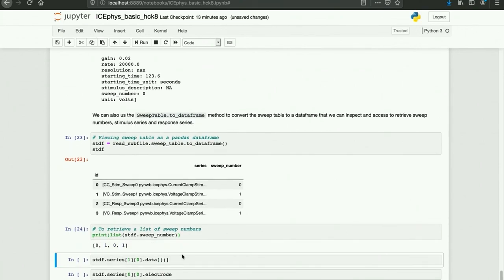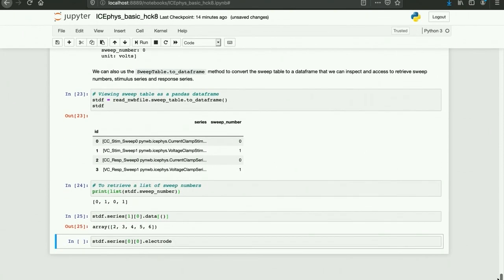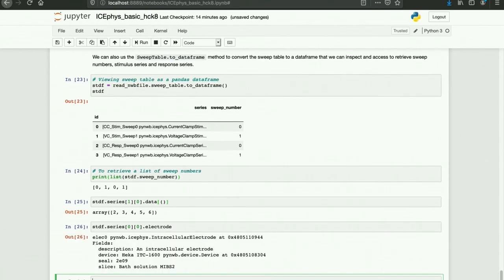We can retrieve the patch clamp series for a given sweep using NWBFile.sweep_table.get_series, which returns a list of the sweeps in our file associated with sweep number zero. There is also a sweep table to data frame method that will convert the sweep table to a data frame that can be inspected and used to access sweep numbers in the stimulus and response series. Using the data frame, we can retrieve sweep numbers, look at data from a particular patch clamp series, and also retrieve metadata such as the electrode for a given patch clamp series.